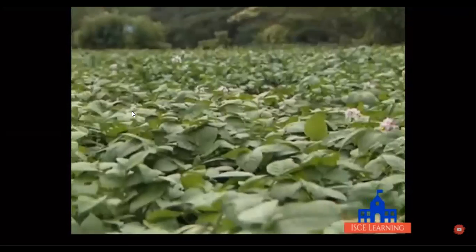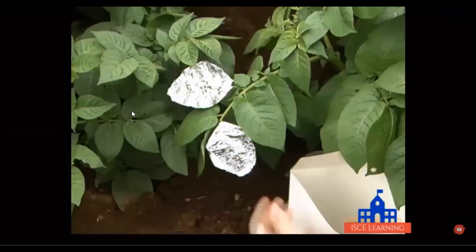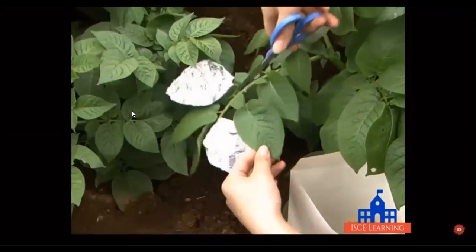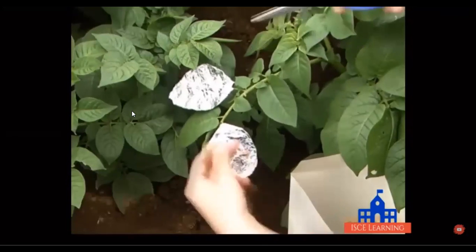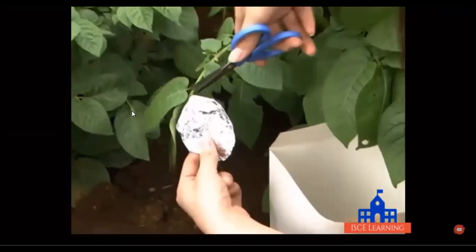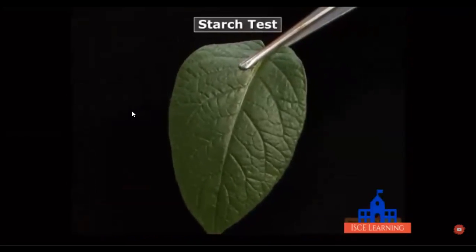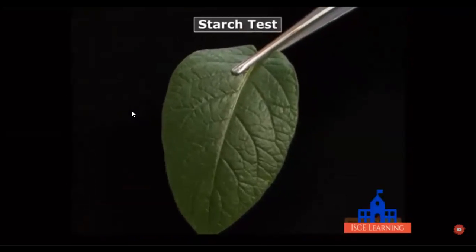Any starch present in the plant leaves after destarching is formed under experimental conditions. The plant is then exposed to light for a few days. A few uncovered, exposed leaves and leaves that were covered with foil are then detached from the plant. Starch test is then performed on the detached leaves to examine the presence of starch.